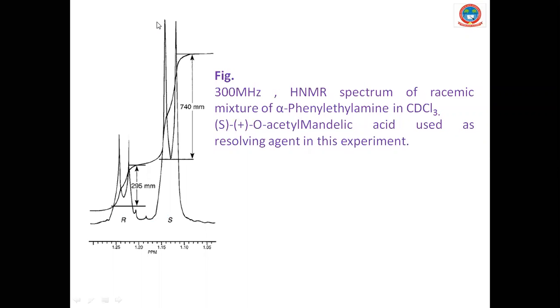Based on the integration, you can find out the amount or percentage of S or R enantiomer present.